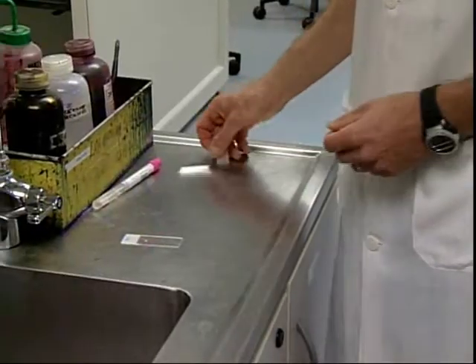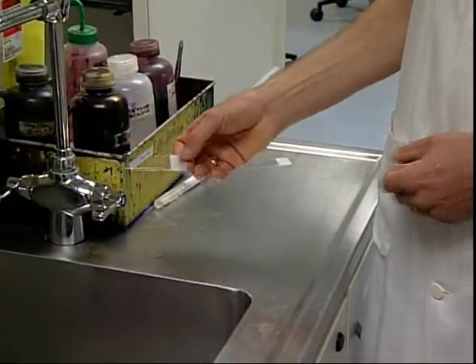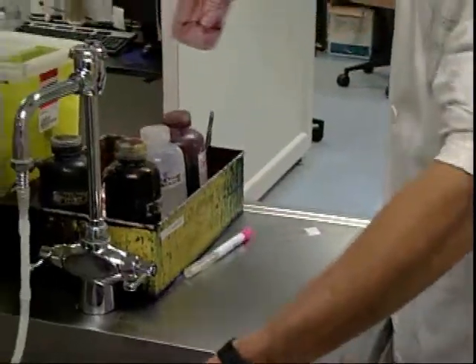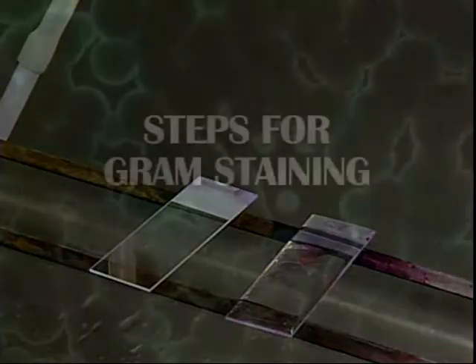With a fluid, like a spinal fluid, it's centrifuged first, and then we cover it with methanol to fix it. We don't heat fix it, and then we're ready to stain it.